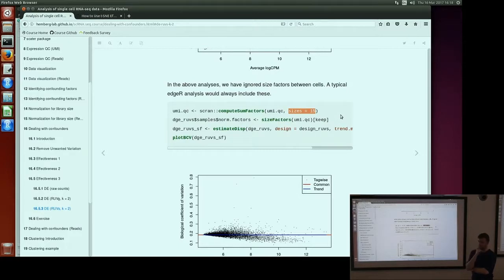between the cell types. But I know Vlad and Martin have also thought about the identification of marker genes between cell types in more depth, and I think they would agree that if that's your aim, there are better ways to find marker genes than to use, say, an EdgeR approach, which is really designed for designed experiments. Would you agree with that? I think they are nodding, so yes.